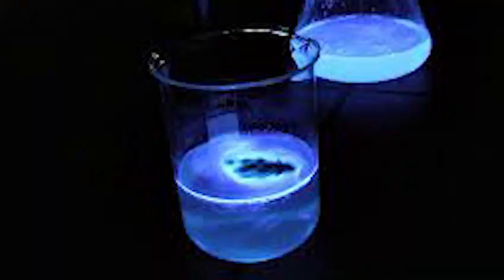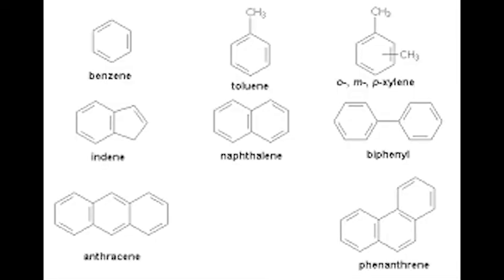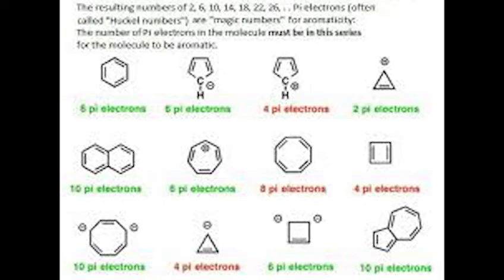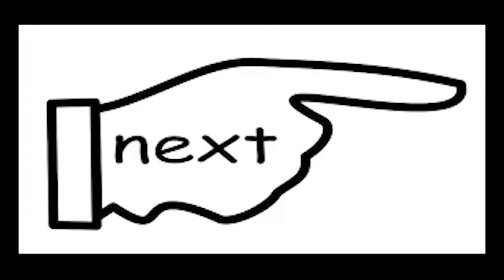Luminescence is the emission of light by a substance when an electron returns to its electronic ground state from an excited state and loses its energy as a photon. However, not all luminescent substances are fluorophores. Fluorophores usually contain several combined aromatic groups or planar or cyclic molecules with several pi bonds. For example, naphthalene and aniline.